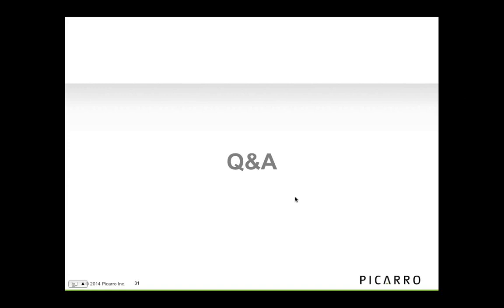Nick, I had a question about if you can give a little more information about the Forerunner multiplexer and how it works, and then I have a follow-up on the ISO-FD chambers. Yeah, so the Forerunner multiplexer is going to be ready in April of this year, and it's for up to 12 Forerunner chambers in a recirculation mode.